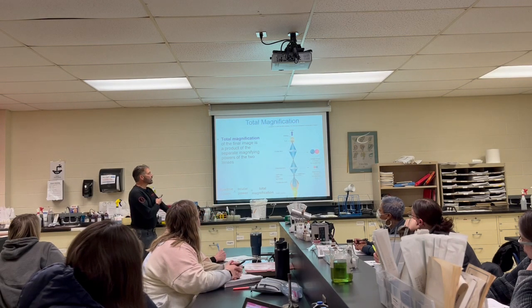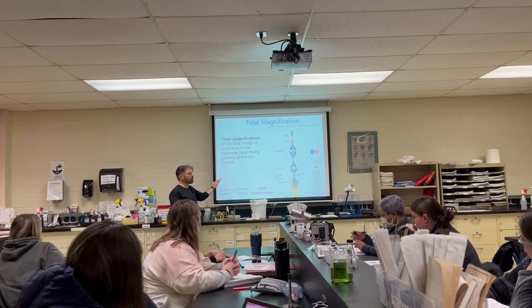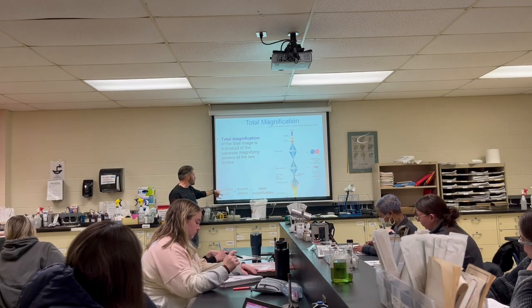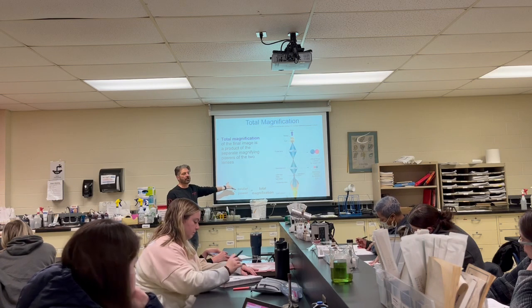Total magnification again, if they ever ask you, I like to go ocular times objective. It doesn't matter, objective towards ocular, ocular towards objective, that's your total magnification.